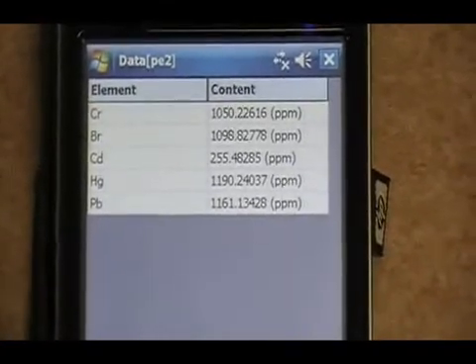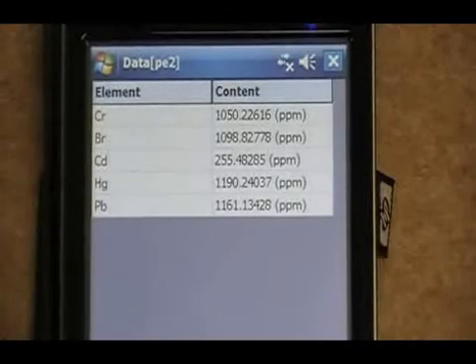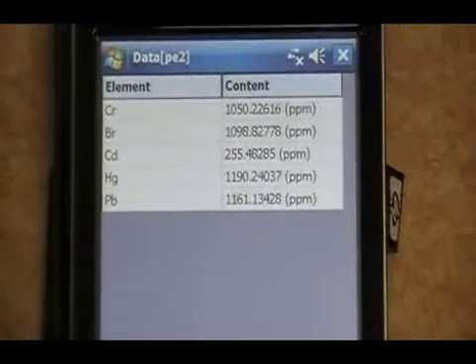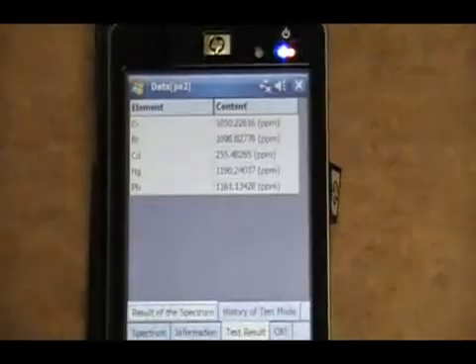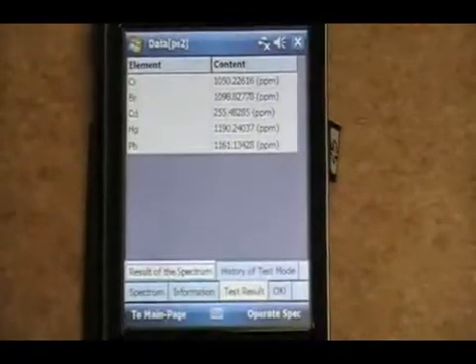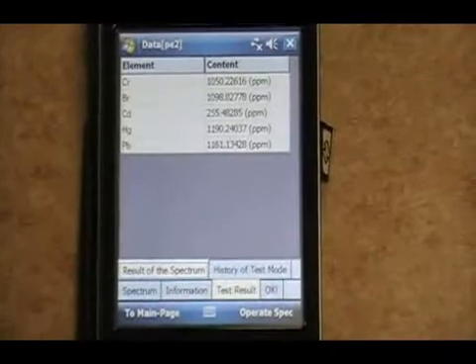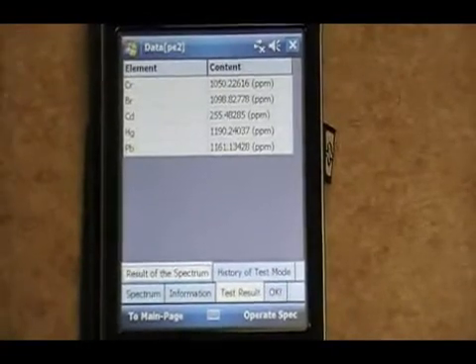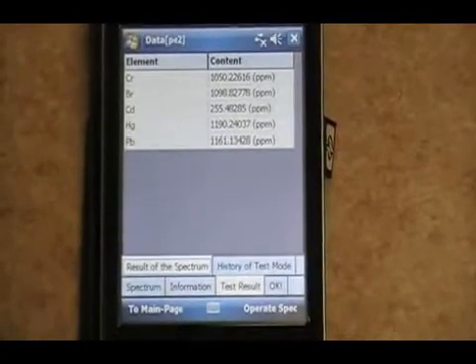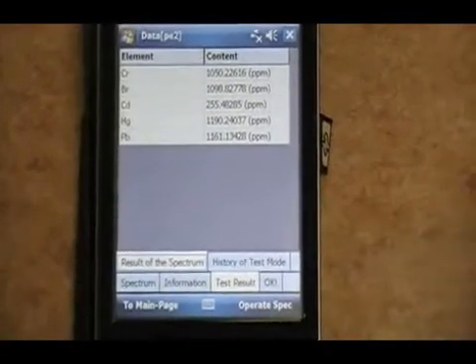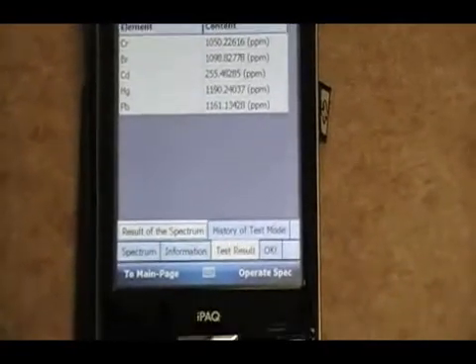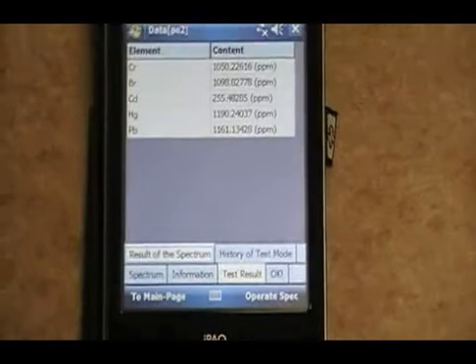So as you can see, all these are within approximately 10% of the goal. And that's what this unit is for and how it will screen. It says OK. So this analysis is done.